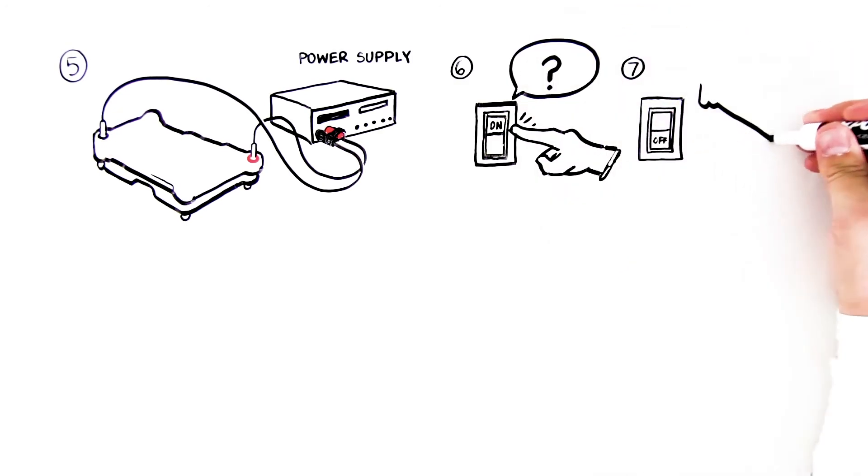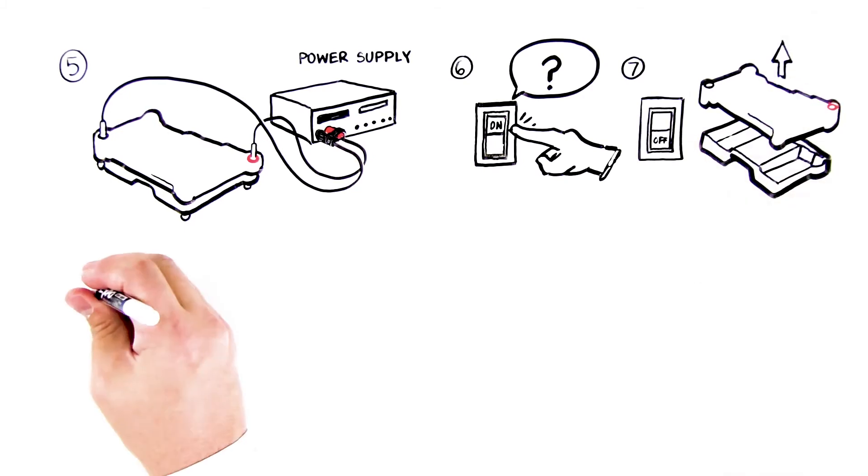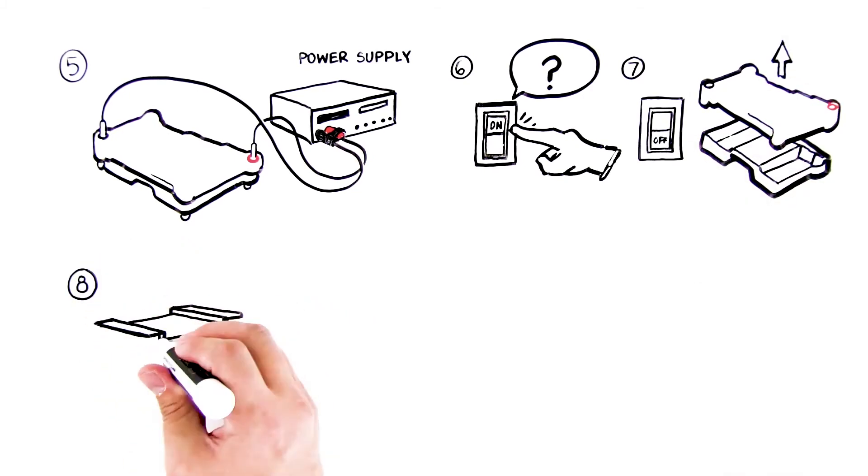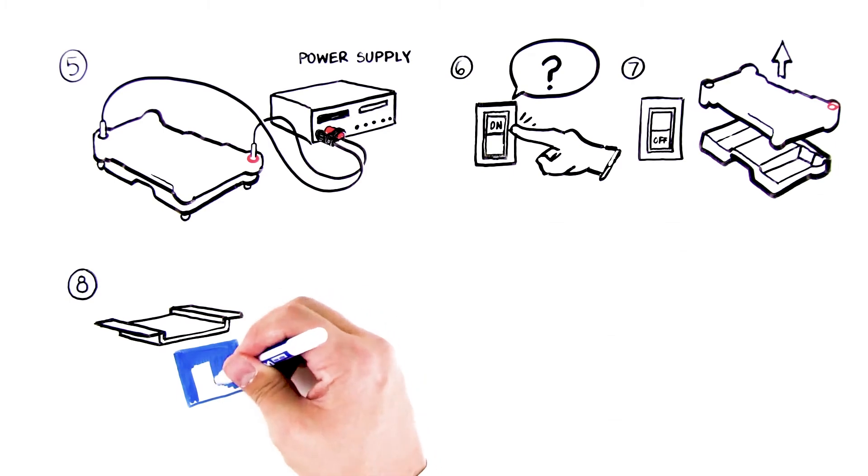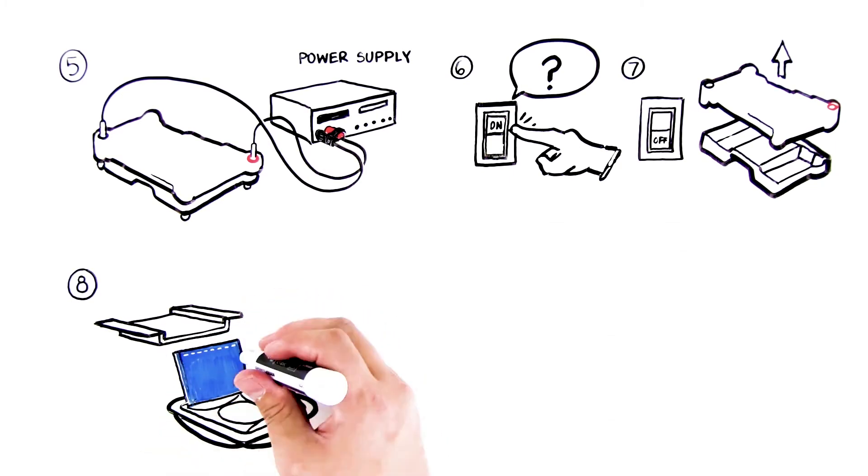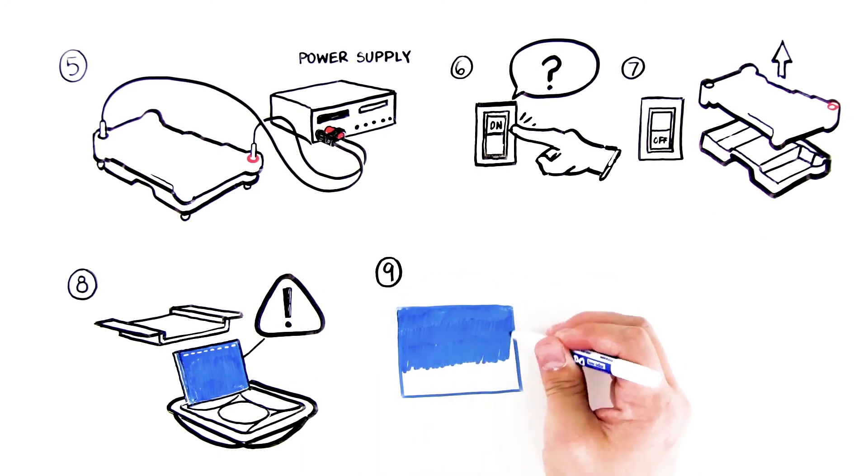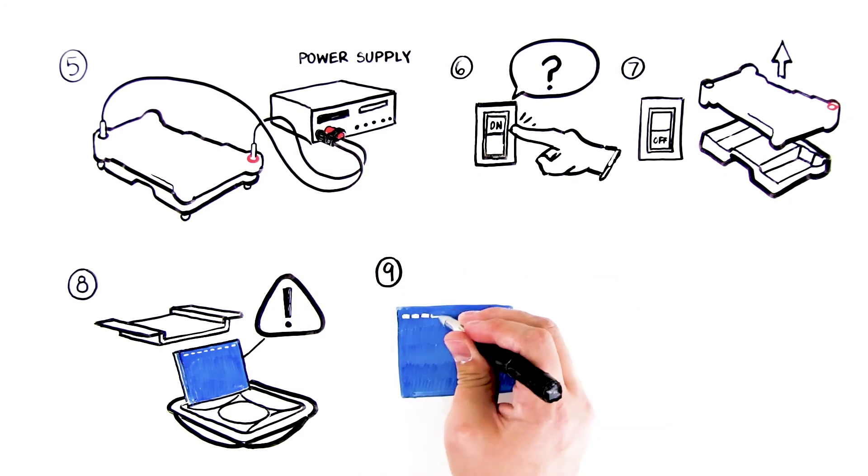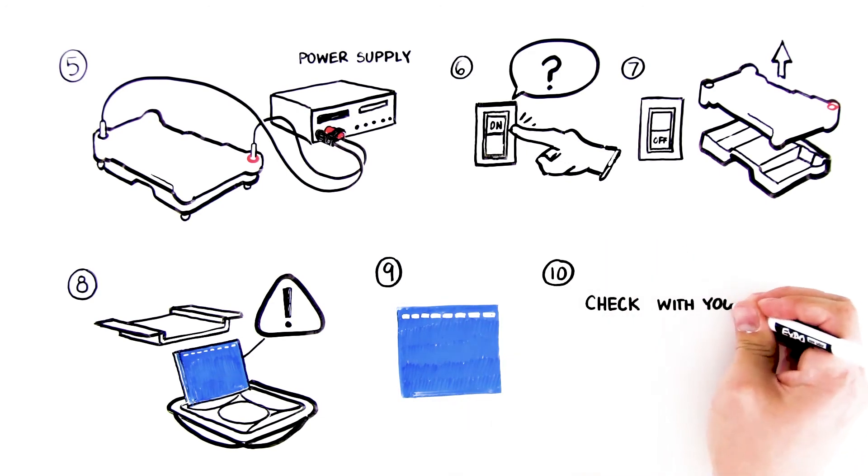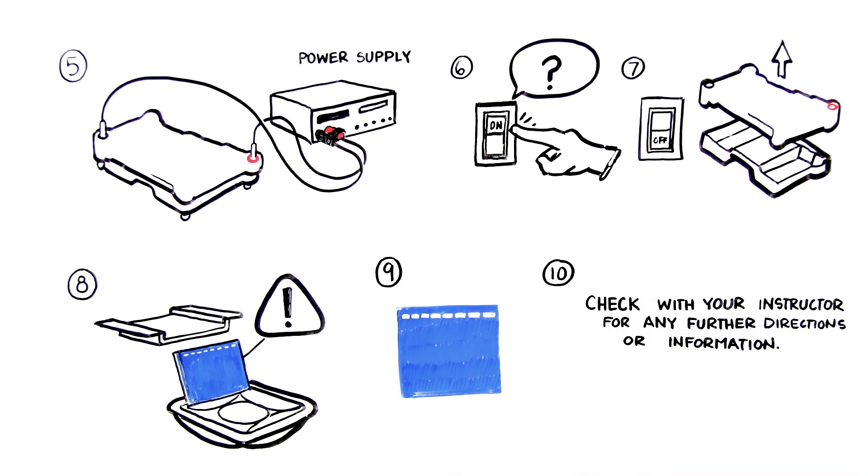When the electrophoresis is completed, turn off the power and remove the lid of the chamber. Carefully remove the gel from the electrophoresis chamber and transfer it to a gel staining tray. Be careful, the gel is very slippery. Stain and visualize your gel as directed by your instructor. Check with your instructor for any further directions or information.